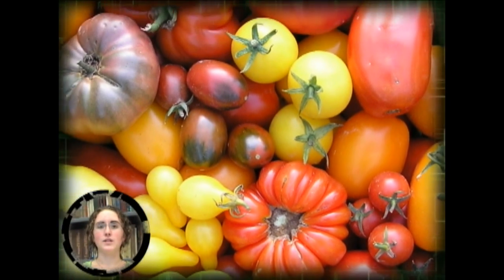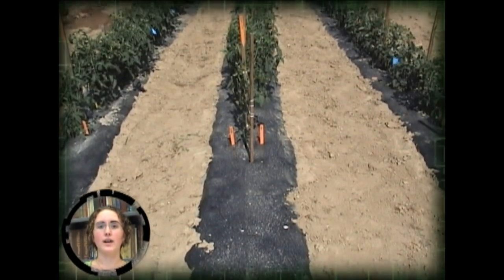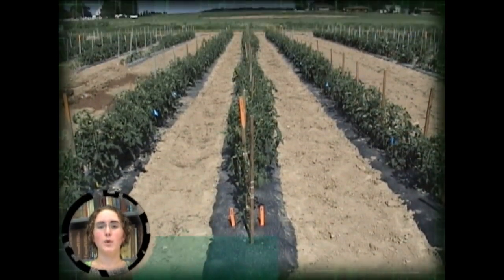Hi, my name is Sarah. I'm an intern at The Ohio State University's OARDC working on the integrated organic grafting project. In this video we will be describing how we graft tomato plants.